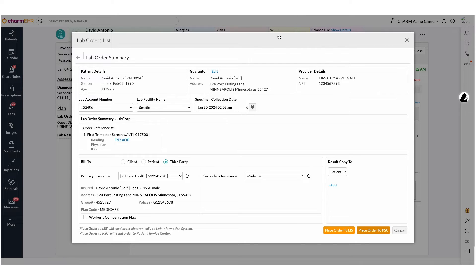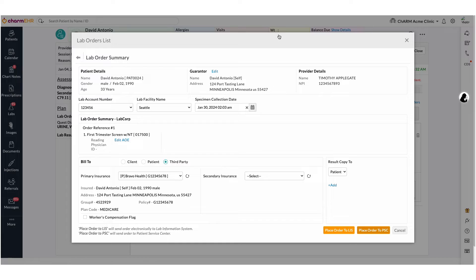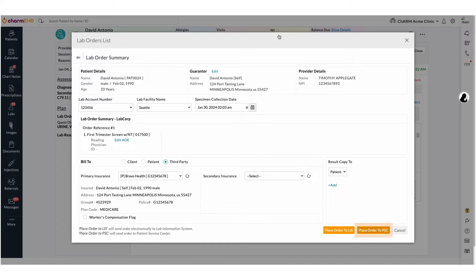Please note, lab orders can be electronically sent to the Patient Service Center or Lab Information System based on your requirement. If you are not collecting the specimens in-house, you can place the order to PSC. In this case, you could choose the bill type as patient.